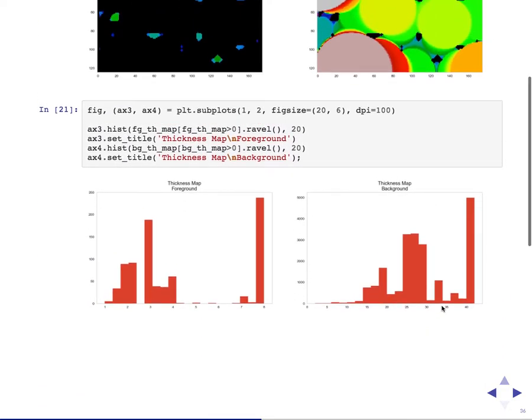You can then do sort of the histogram on these things, where you can start to get analyses of what volume fraction is made up with this gap or this size spacing. So here you can see how many objects are of this radius, and here you see how many objects are spaced this far apart.